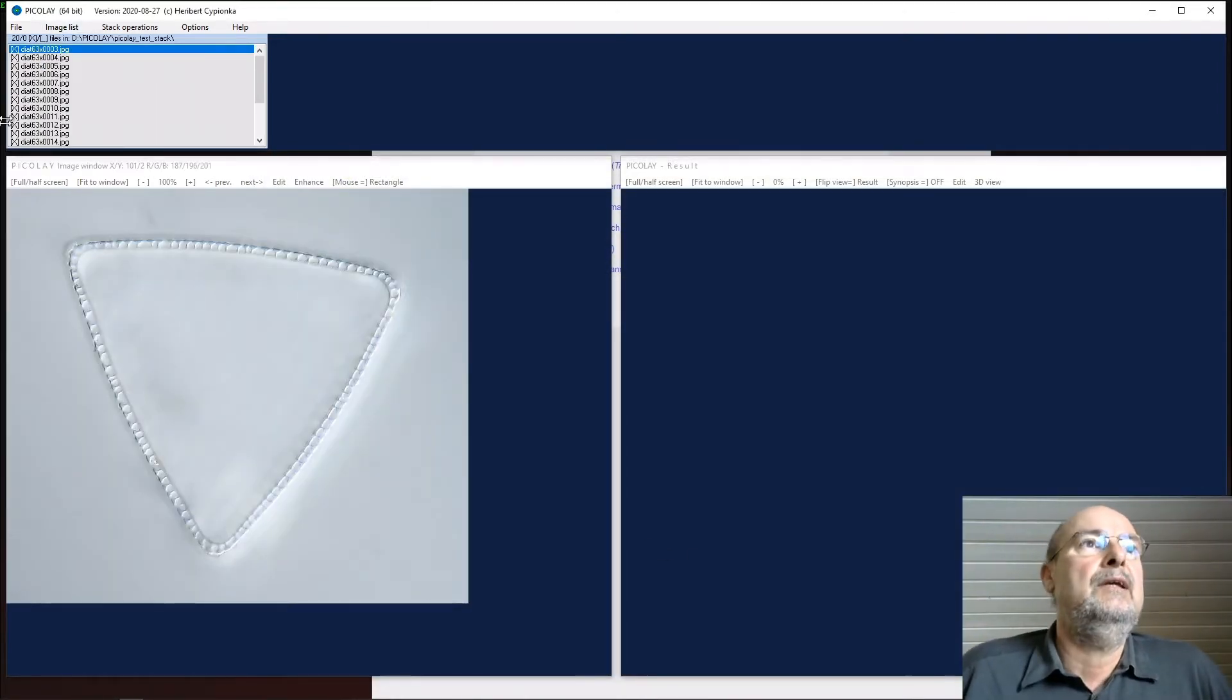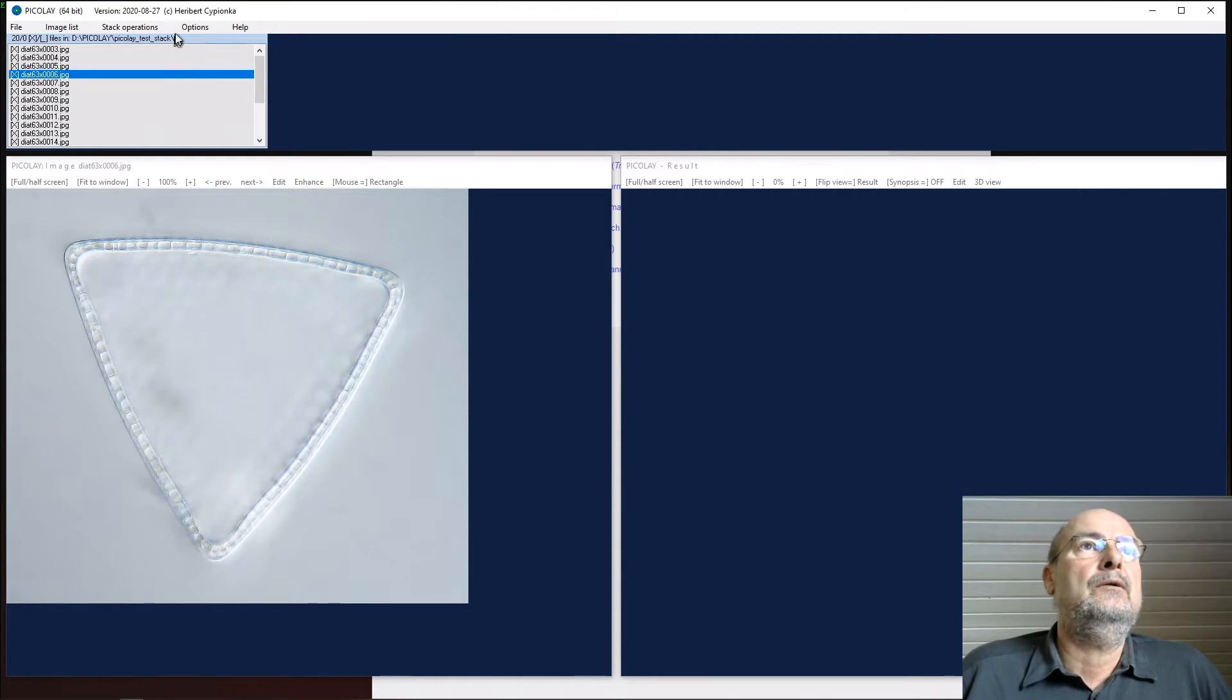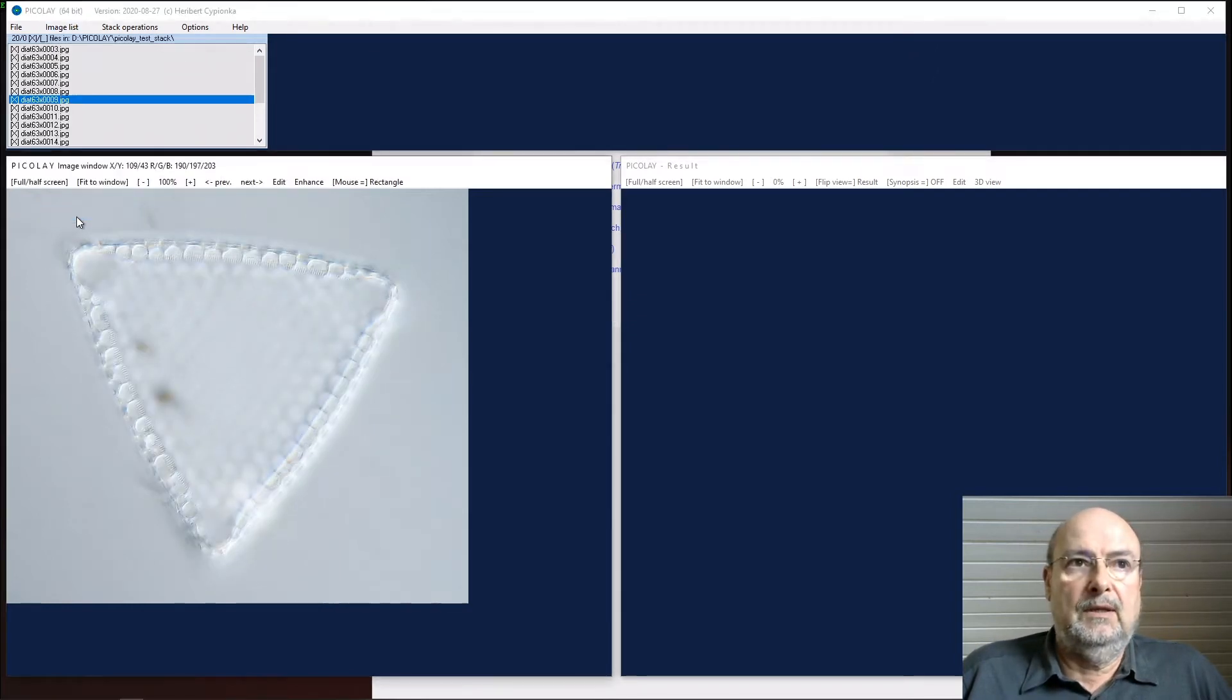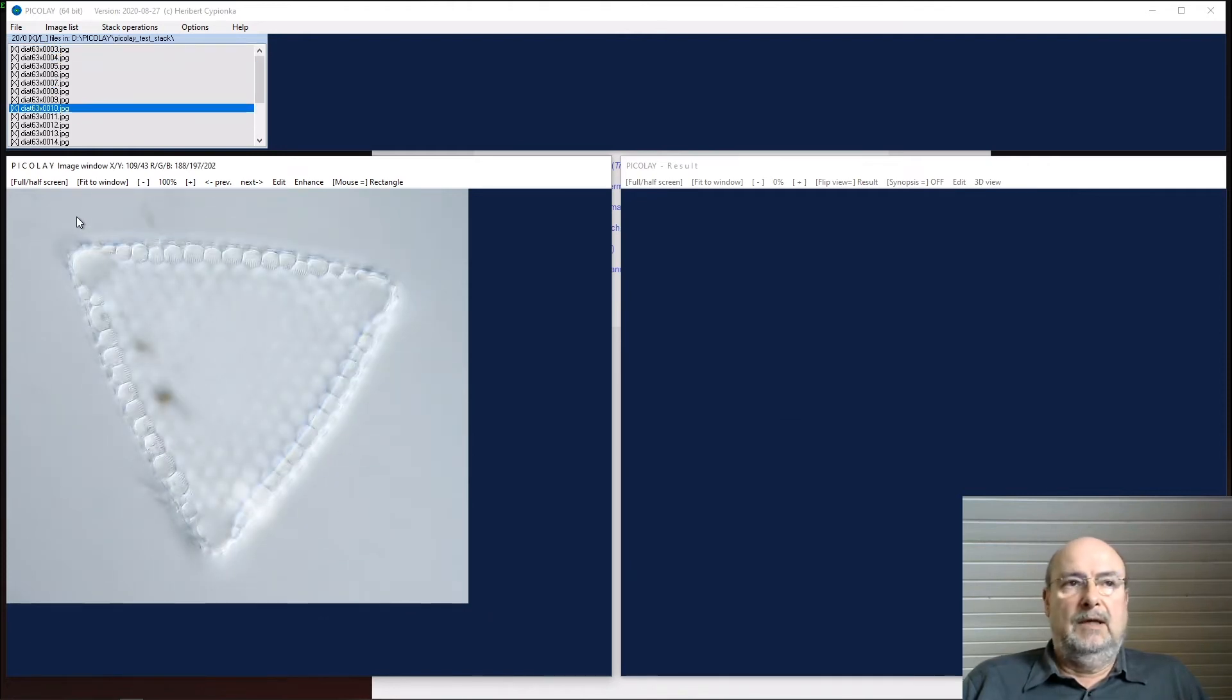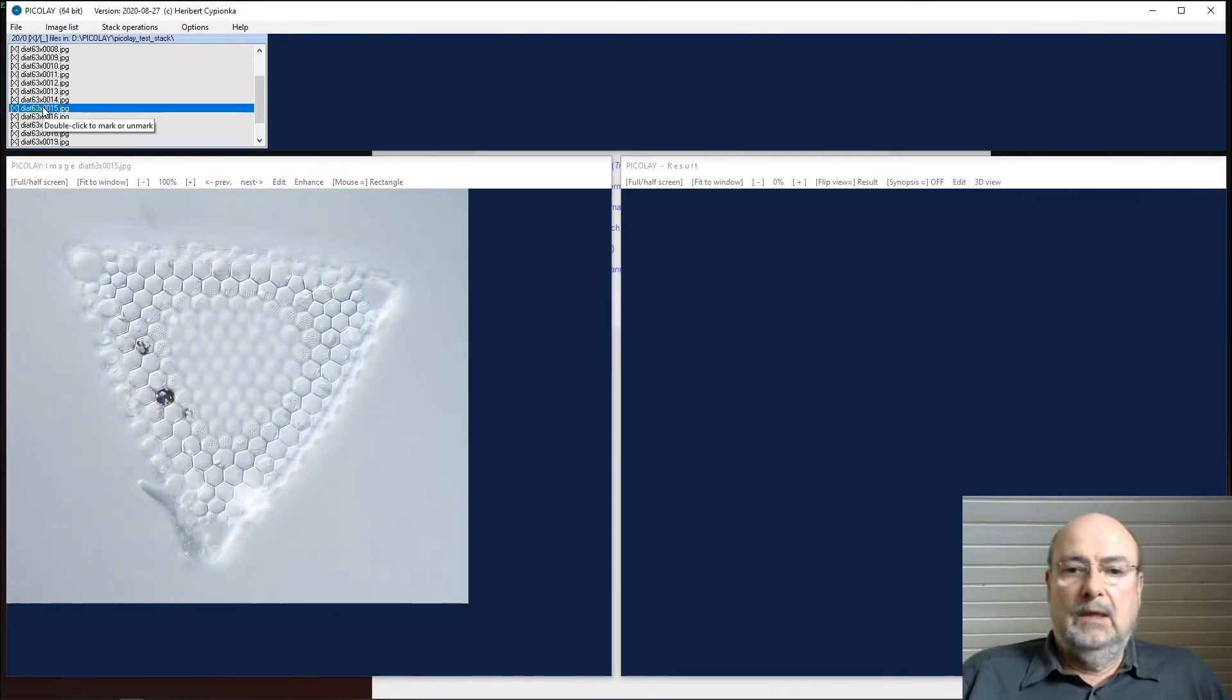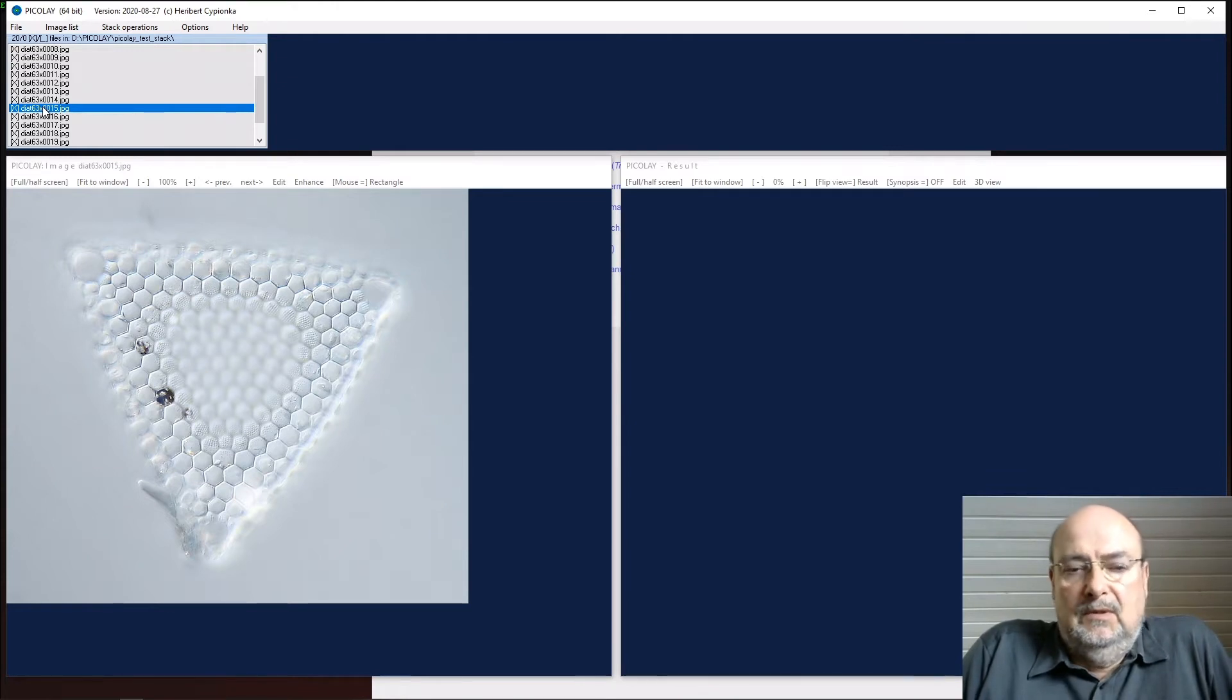So we have the list here. The names are listed, you can click on the images to look how they are, or you could make a little slideshow. Stack operations, sorry, image list, start slideshow and it will be shown. You can look whether everything is fine and it seems okay.